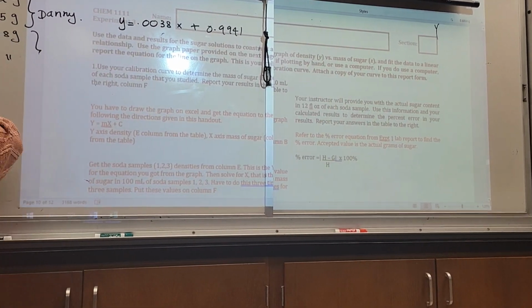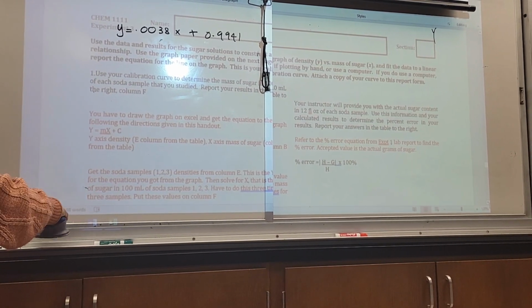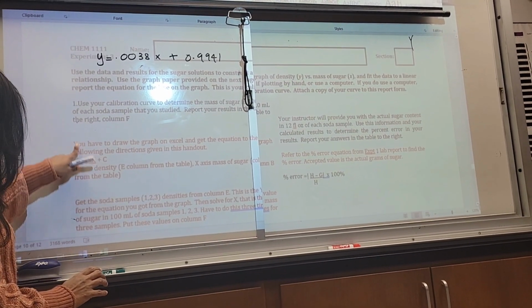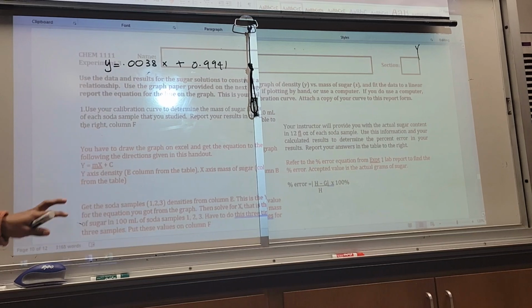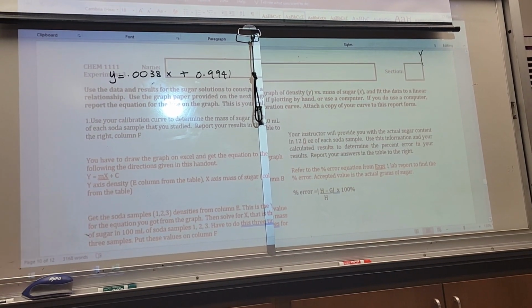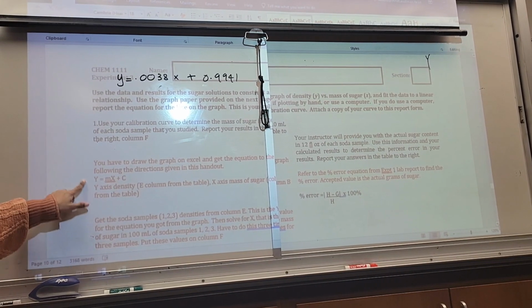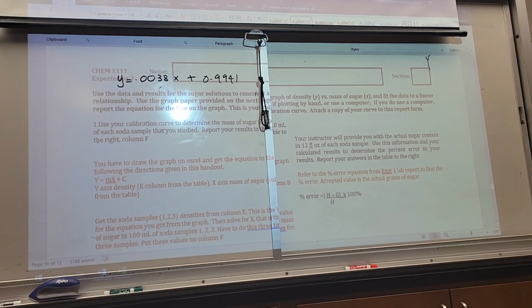Let's see how to do that part from the data. I also have written the instructions here, but there should be another handout on Blackboard without these instructions. That's what you need to turn in. You can write, show me how you did your calculations. Okay, so we have this.